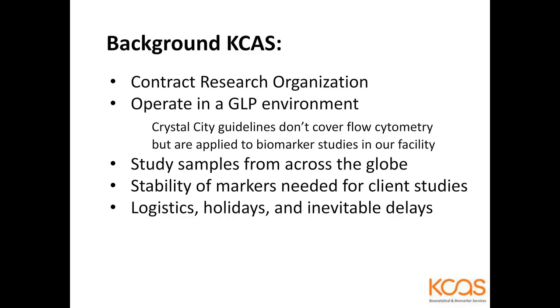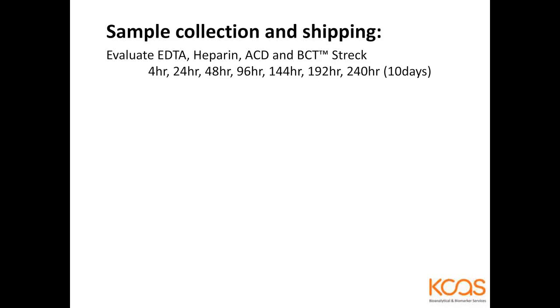We receive study samples from across the globe, and one of the things that is critical is the stability of those biomarkers during transit, over holidays. There are always delays in shipping. So one of the first steps I undertook was to characterize some of those biomarkers we would be offering in our portfolio during transit and stability studies.